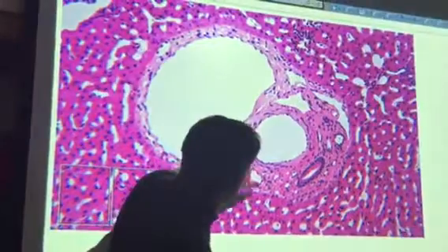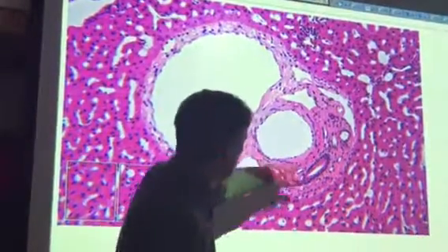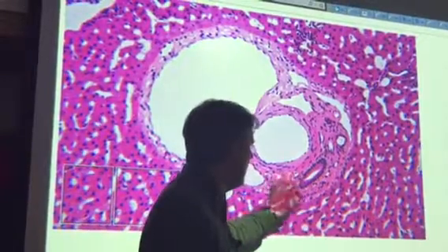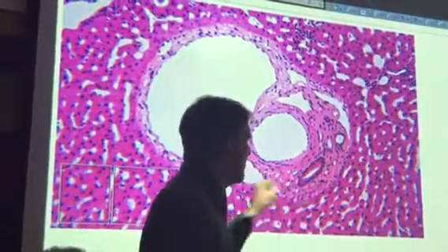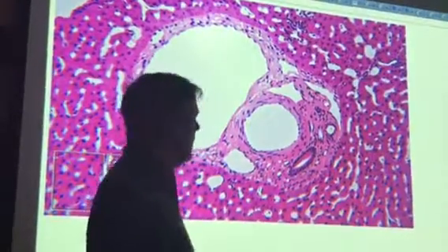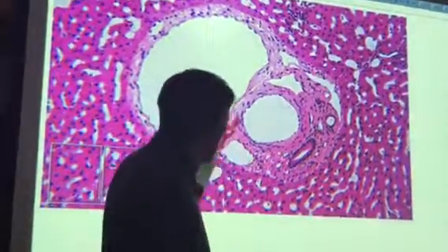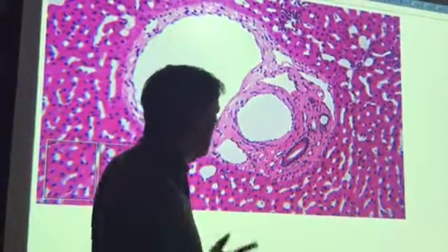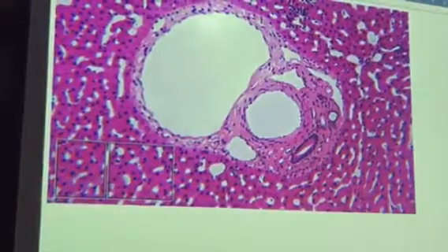You may see some smooth muscle in the wall, so that's the branch there. And then this guy, which has a simple cuboidal epithelium and fairly dark nuclei, that's the branch of the bile duct, all right? What are these other things over here? I don't know. It may have been separation when they made the slide. I'm not even exactly sure, but those are the three things.